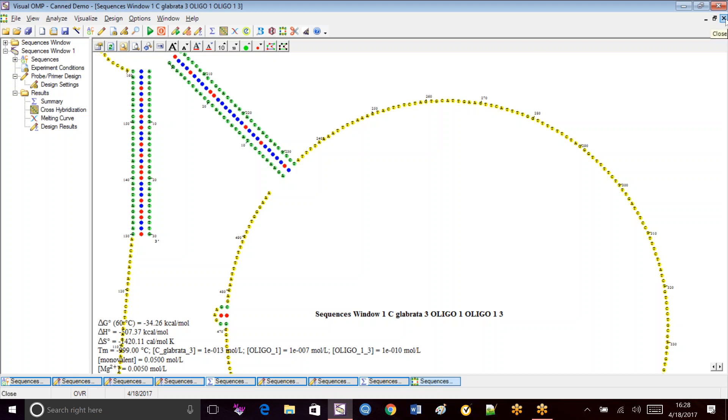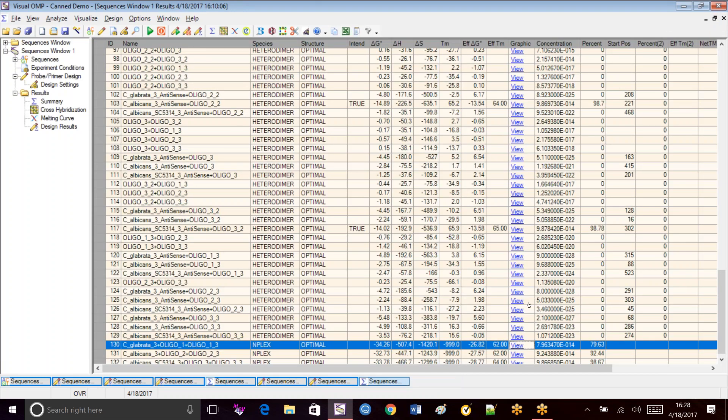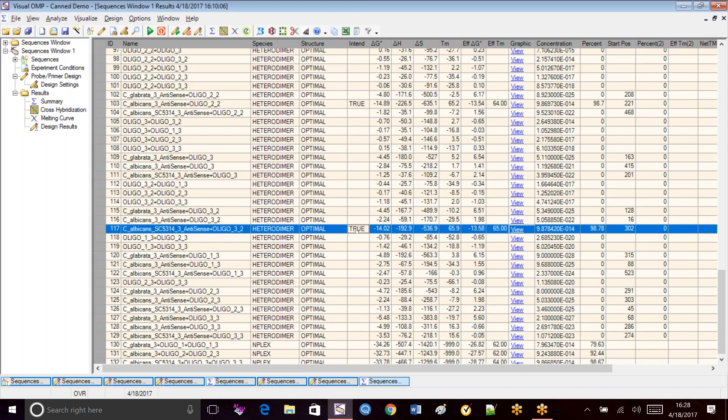So looking at that in the N-Plex, the probe and primer are going to take up 79.63% of that target. So we might want to try and raise that up. But we're going to finish looking at the rest of our N-Plex to make sure everything else is okay.